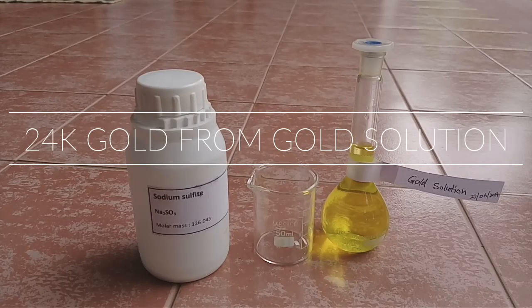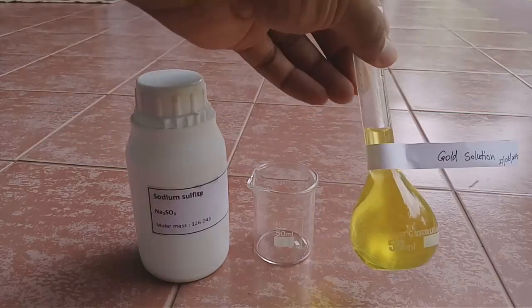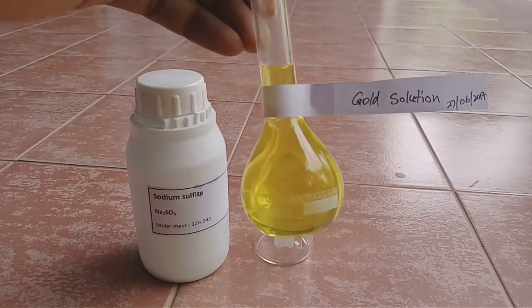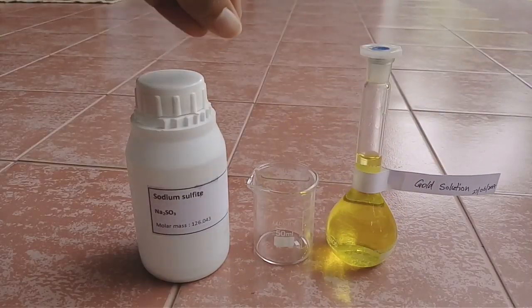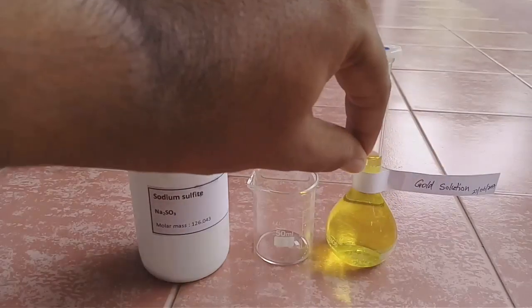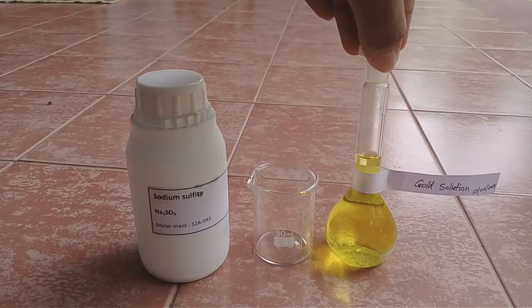Hello there. In my previous video I made gold solution. You can see here this is our gold solution. Today we are going to get gold metal from this gold solution.